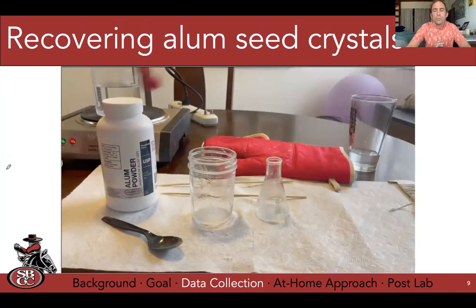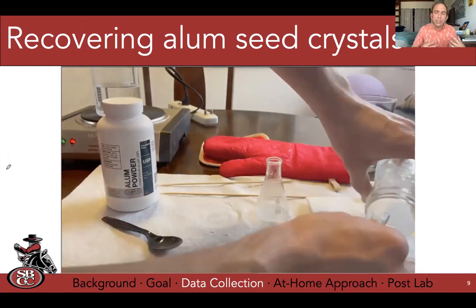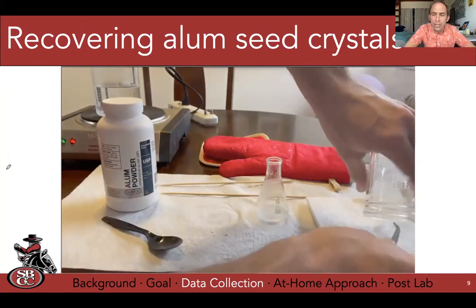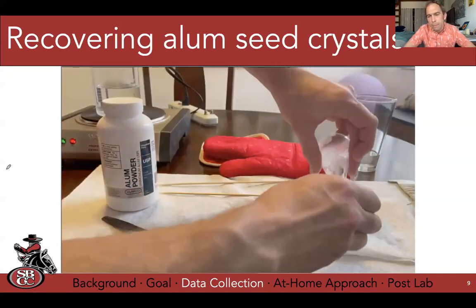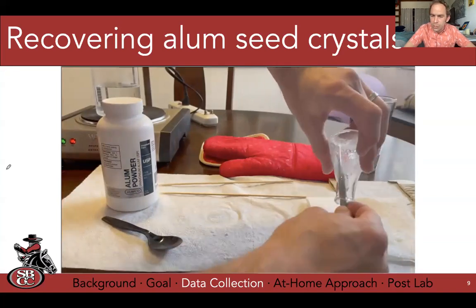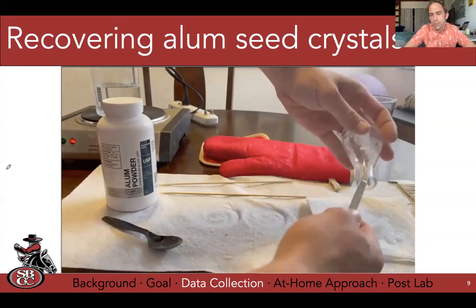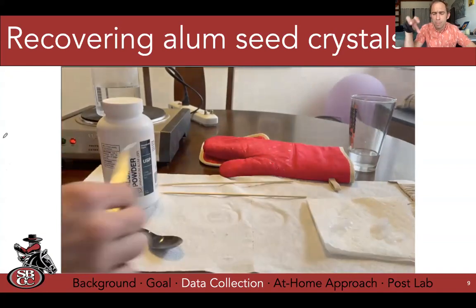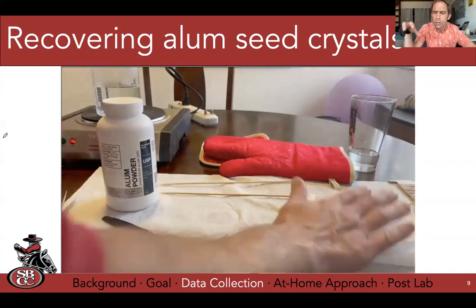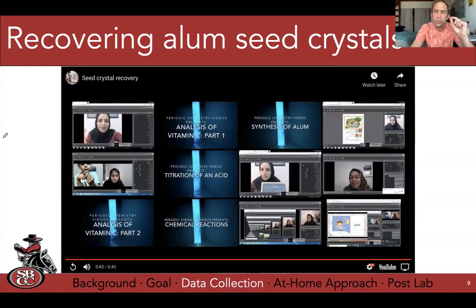And then I just wanted to show you, based on doubling up the amount of alum that I put in, what kind of seed crystals should I expect to get? And the answer is a ton. I still have seed crystals. I'm still doing alum experiments. Both of these would have given me enough seed crystals to do dozens of experiments. And I ended up just giving them to my daughter's crystal collection. So there is no benefit in increasing past a tablespoon to making seed crystals. Just bring it right to that solubility point, wait 3 to 4 hours, and then you should get crystals that will work well for seeds.